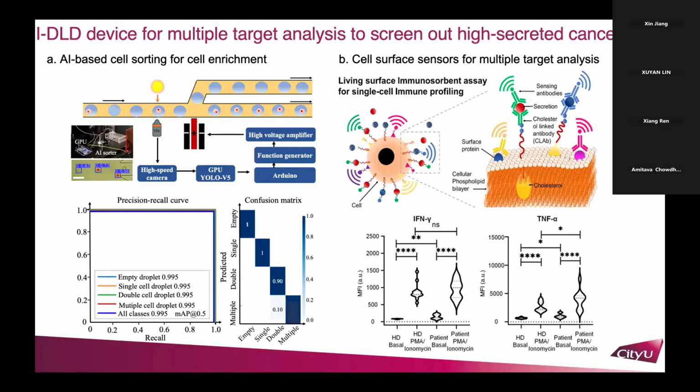And we hope in future this platform could capture different targets at different time points through continuous medium exchange with our device. We hope this device will provide more insightful understanding about cancer metastasis and the related mechanisms of cancer recurrence. And that's all I want to share today.